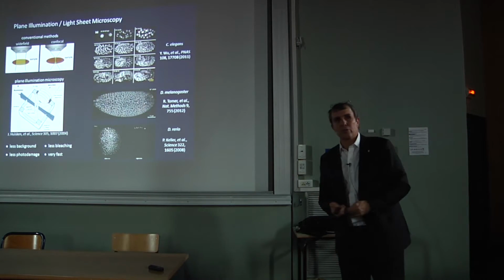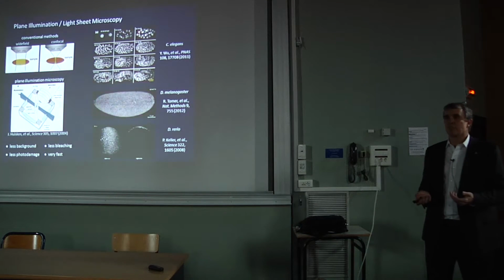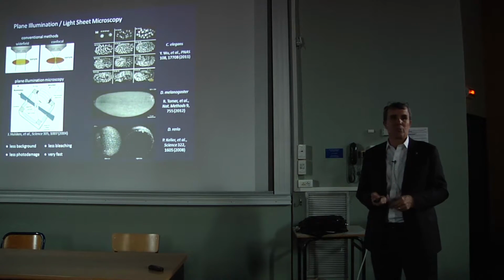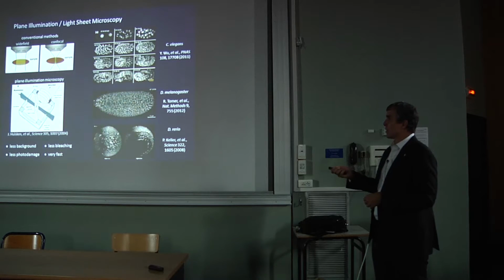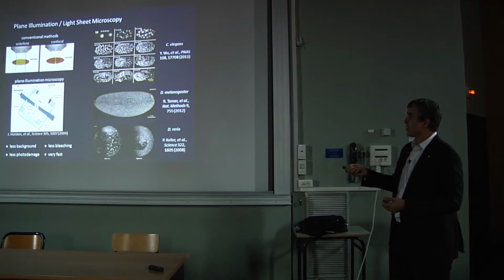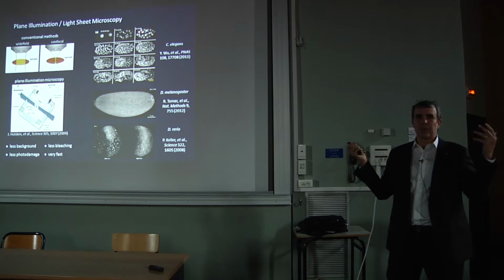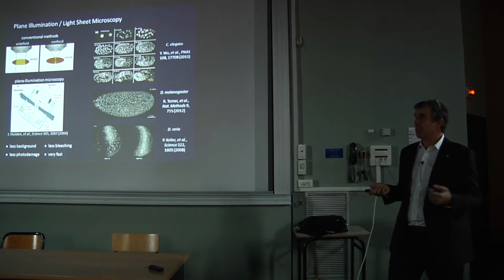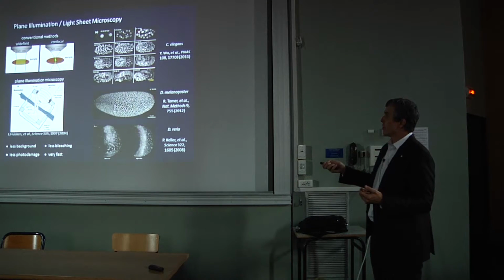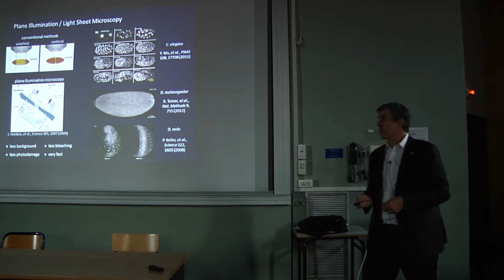And so the good news is that there's a lot of opportunities there, because the most common tools for live 3D imaging leave a lot of room for improvement. They're the wide field and confocal microscope. The problem with these methods is that only the focal plane gives high resolution information, and all the stuff in the other planes is just out of focus. In the wide field microscope, that just creates a background that gives you problems. In the confocal microscope, you use a pinhole to throw out that background, but you're still doing all of this damage, all of this bleaching in these other planes as you're going along.